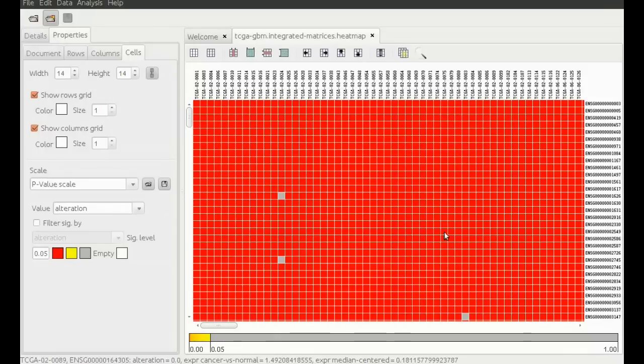After loading the results, we can see the matrix that is represented as a heatmap. We can see the patients as columns and the genes as rows.